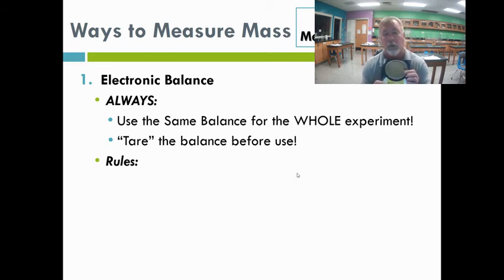What we'll do is you'll press that. It'll usually be on. Just press that button once more and let it go, and it'll change the reading to 0 here. If you've got something like a container sitting on top of here, it changes it to 0. And the nice thing about that is then when you add the chemical in, it tells you how much mass comes right from the chemical. We've already taken out the mass of our container. We've already used the tare to zero that out.